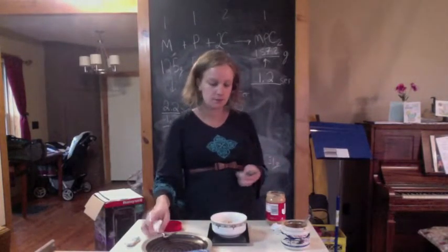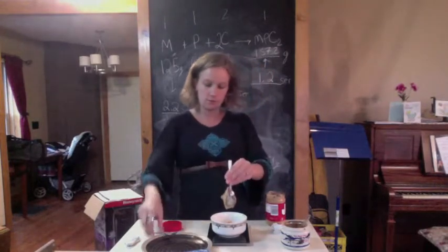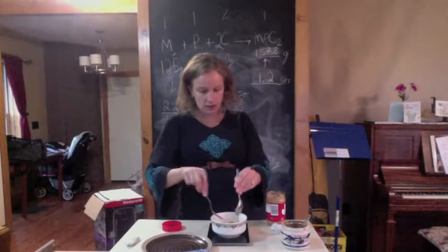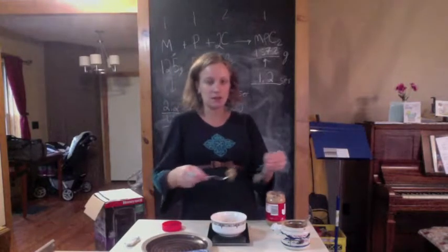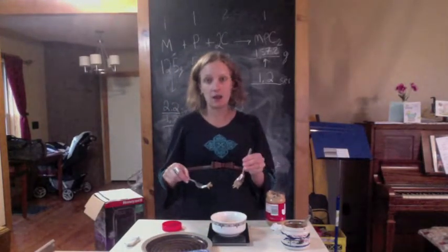30 grams. Looks like it'll be too much. 79 grams, so I have to take some away. It's good to measure in little increments so that you don't end up having to take some back. That's a skill that you'll definitely find out if you work in the chemistry lab.